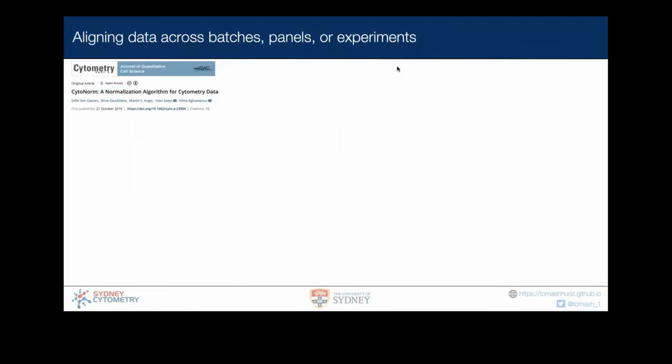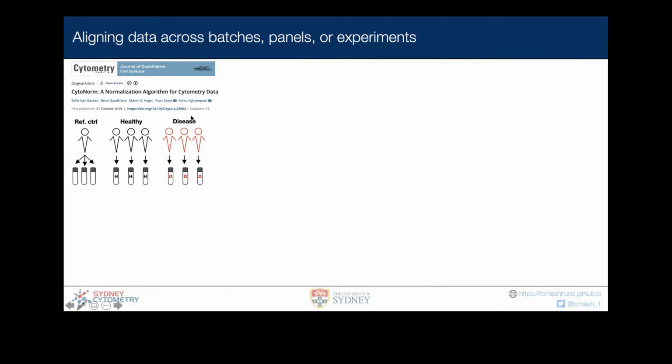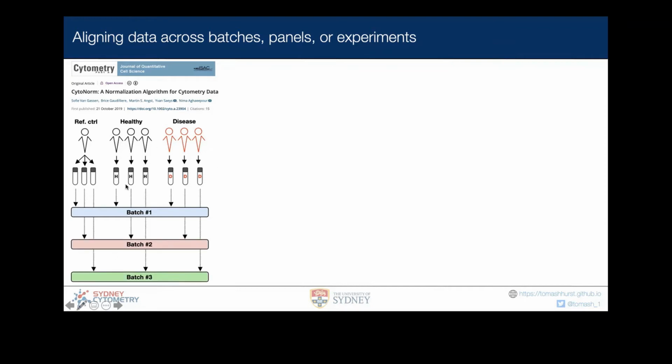Just to give a brief idea of how this works, and CytoNorm in particular, let's say we've got a study with some healthy volunteers and some diseased individuals, let's say it's COVID, and then we can also have a reference control individual. Normally we'd take a single vial of blood from each individual in this study. The reference control donor will provide multiple vials of blood, so let's say 3 vials, and these are all biologically identical. They were all taken from the same individual. As we process different batches of samples, this just depends on when patient samples are available and when we stain them. Every time we do a batch of samples, we want some healthies and some disease, and we'll take one of the reference samples in that batch as well. So each batch has some healthy and some disease in them and one of each of the reference controls.